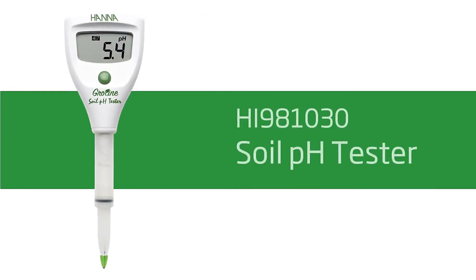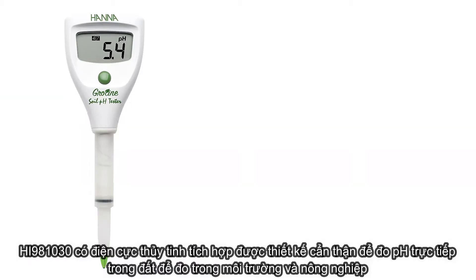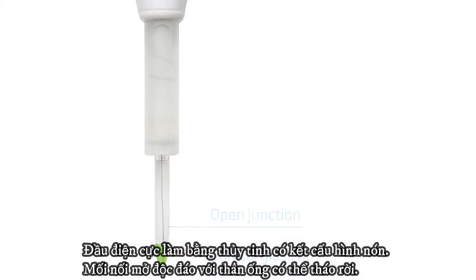Our HI981030 GrowLine Soil pH Tester is designed for taking measurements in soil slurries for environmental and agricultural testing. The built-in probe features an open reference junction, a conical glass tip, and a removable sleeve design, making it ideal for measuring the pH of soil.